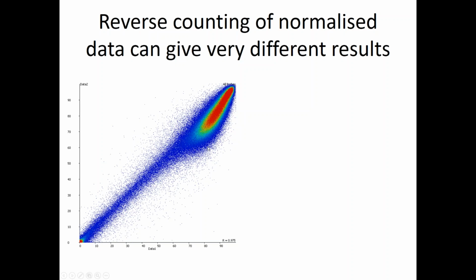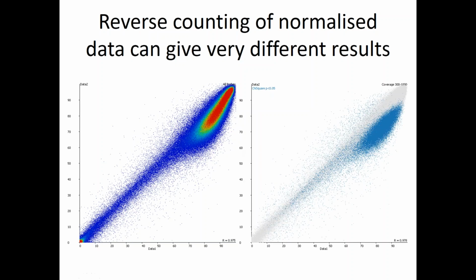It's because the sample here had been grown in culture for a few cell divisions, and when you culture things and cells grow quickly, the maintenance methylation doesn't quite keep up, so the methylation level can drop slightly, but for entirely uninteresting reasons. If you just do a standard analysis on this data, these are the points that come out as differentially methylated. Okay, it's the points at the bottom of this, and it's purely related to their original methylation level. It doesn't reflect the specific changes, it just reflects the global change in the sample.